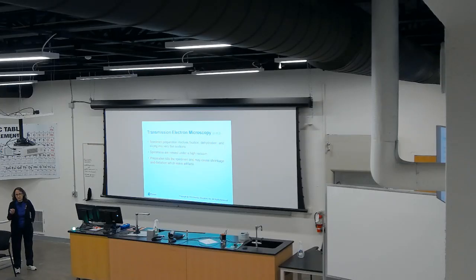Now, if it's a thin slice from a specimen, it is not distorted as much; in that case, vacuum doesn't do as much damage.